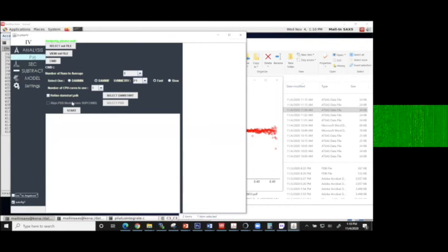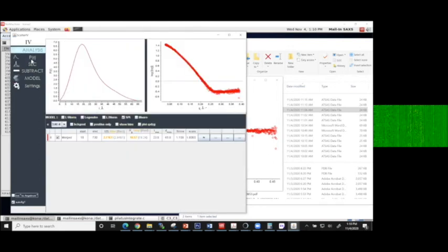No, P of R. Somewhere in here, it'll do if you've got ATSAS. In order to generate shapes, you need the ATSAS suite, which is also related to this Primus thing, and you have to link this program through that in the settings. Basically, you hit go, and it'll give you a shape for the system. So that's how you would generate shapes.